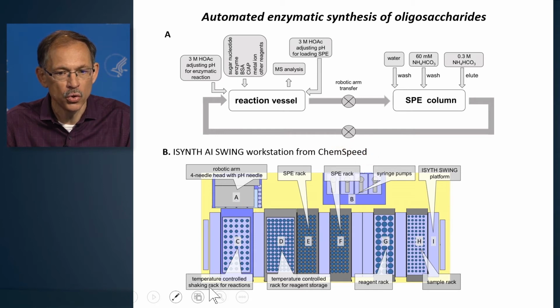And it is composed of a temperature controlled rack where the reactions take place, reagents that are also stored in a controlled manner. The solid phase extraction resins are put in another rack, and then we have components for further reagent addition. All is handled by a syringe pump that drives a robotic arm that has also a pH needle.